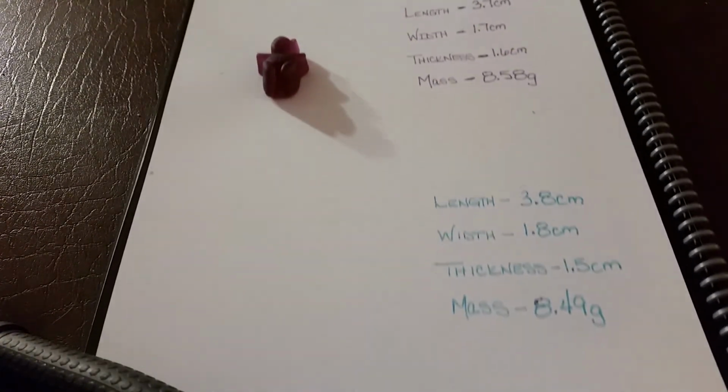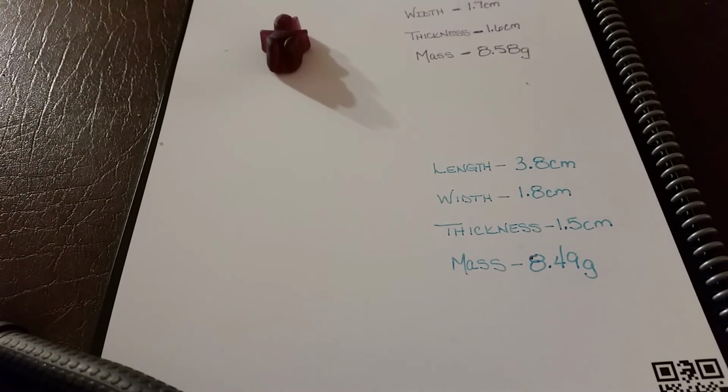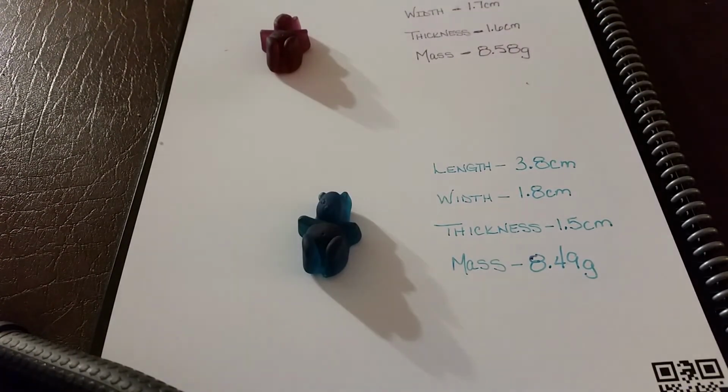For the blue bear, the length is 3.8 centimeters. The width is 1.8 centimeters. The thickness is 1.5 centimeters. And his mass is 8.49 grams. Make sure you fill that in on the 2 data tables for day 1.